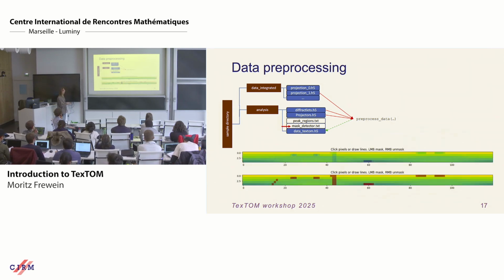And then next we get this panel in the program, and we have to create a mask for the detector. So you have to mask out the panels and so on. You just do it by clicking on the pixels that you want to have away, and in the end the ones that you didn't mask out should be fairly isotropic. I'm trying to get this also automated from the mask from the actual 2D image, but yeah, we'll see.